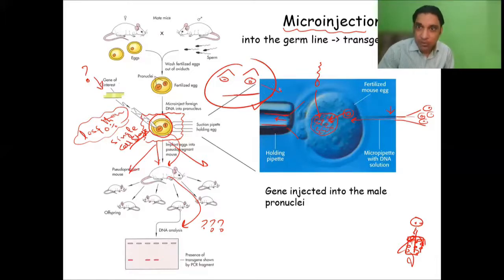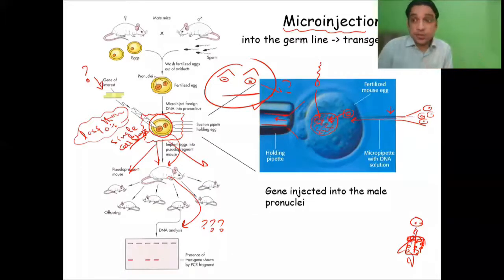What's going on? I mean, this is manipulating a very sensitive and delicate thing. So whatever you are sending, it can go to some important locations. That can also happen, right? Whatever you are sending might land in some important places. This is called off-site incorporation.